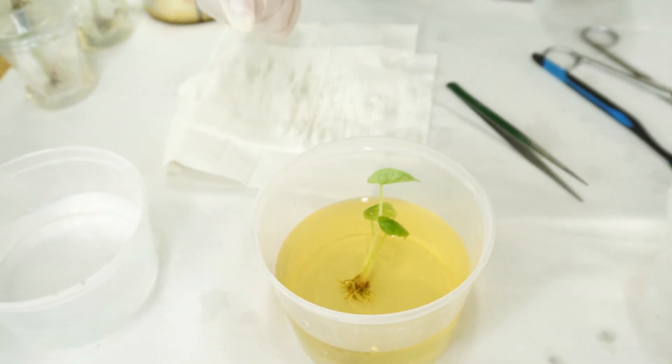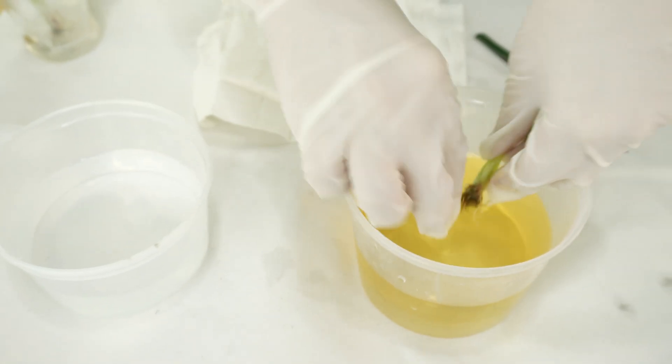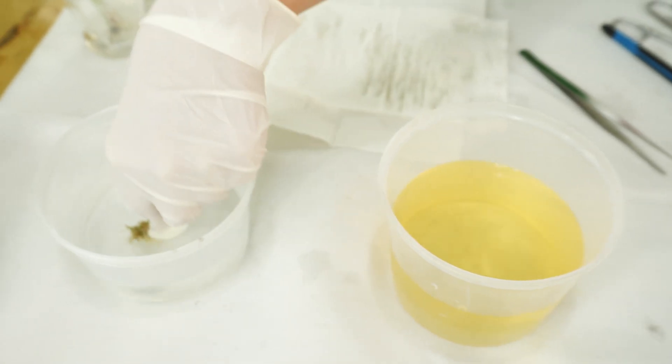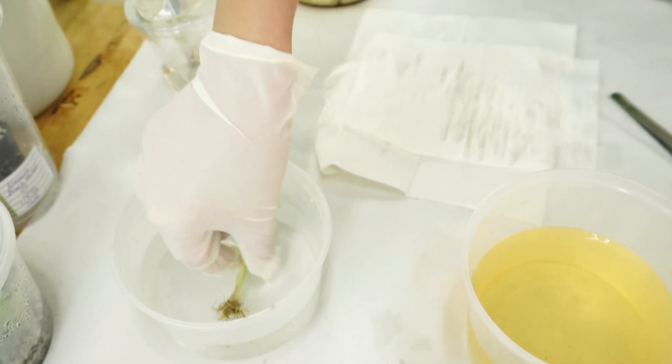Then we're going to transfer the plant from the iodized solution to clean water just to rinse it, and then dry it with a tissue again.